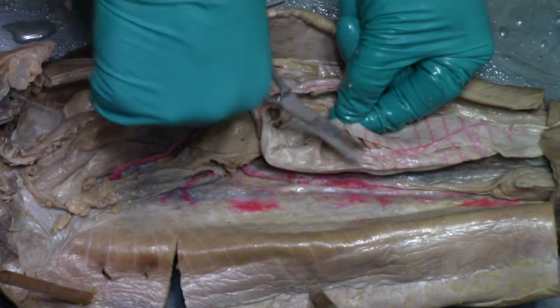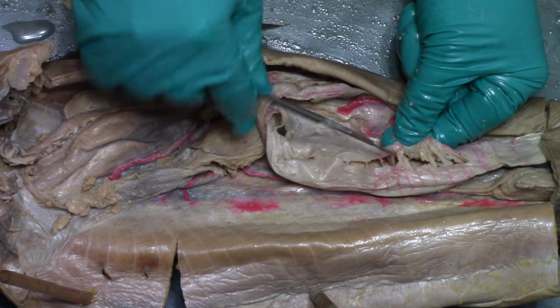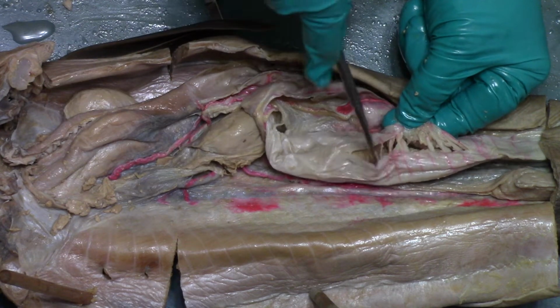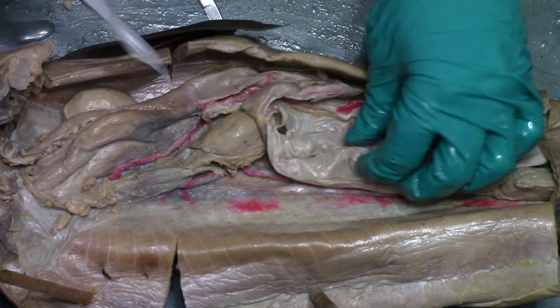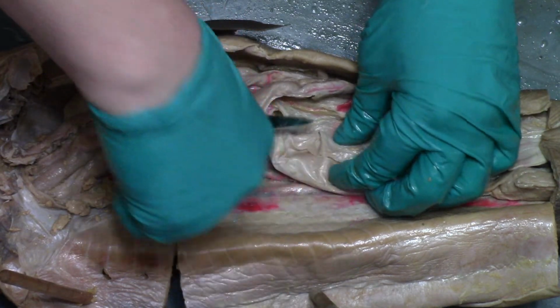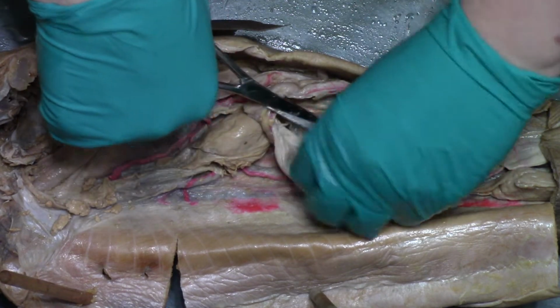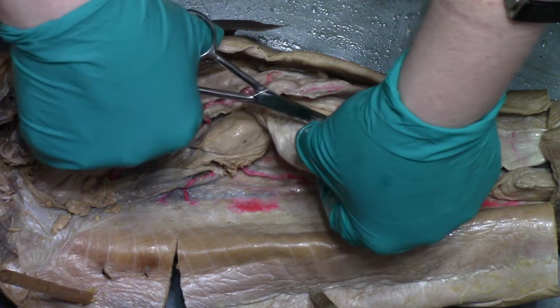This doesn't want to pull apart because there's valves. Each part of this has like a valve. So there's like a chamber and then a valve and then a chamber and then a valve. Let's see if we can cut it. I might have to change my gloves after I do this. It's so slippery.